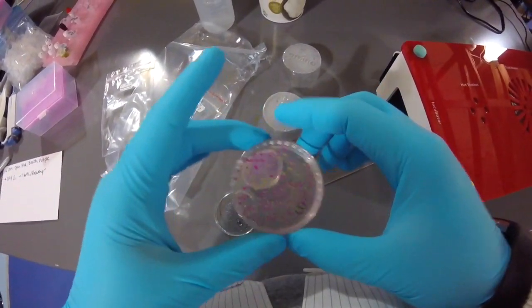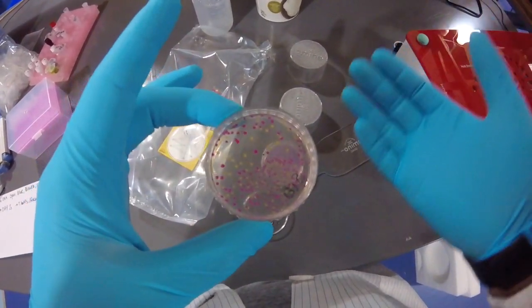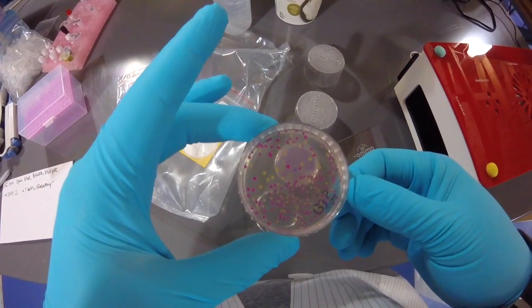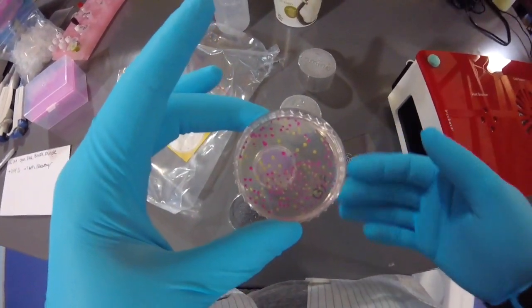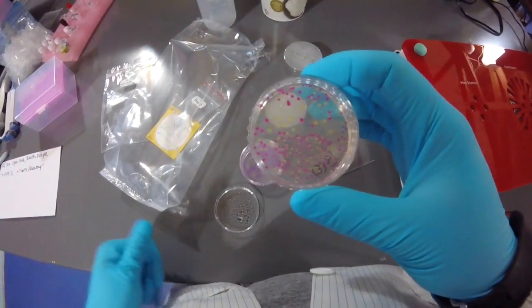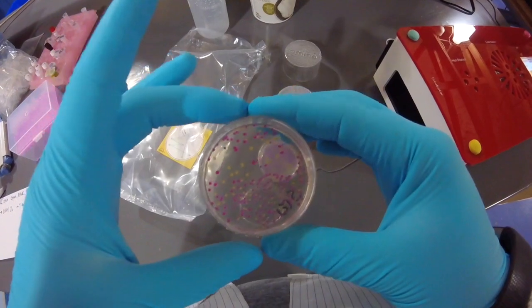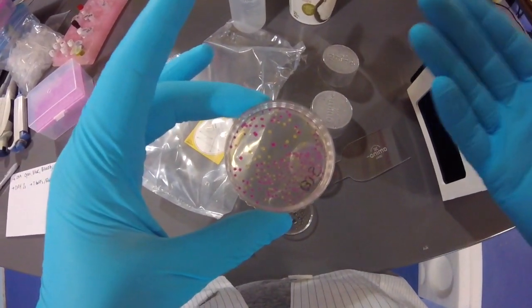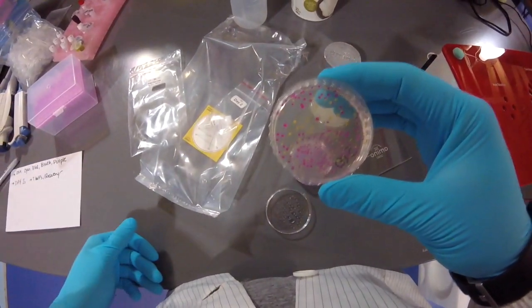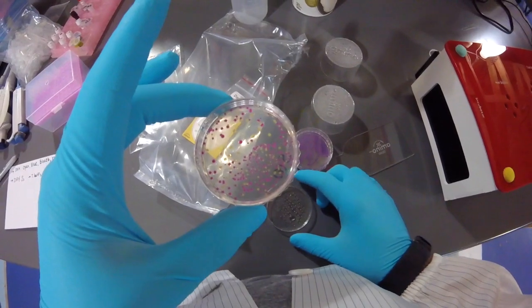And so you might ask, how do we get this result? Why are there different colors? Really the reason is because the DNA we used is a mixture of different plasmids. Those different plasmids have the same selection, so they can all withstand this antibiotic, but they have different genes for the color pigments. So they're just expressing different colorful pigments, and when you transform, a typical cell will take in around one plasmid, maybe a couple, but if a couple are in the cell it will generally grow and divide and lose one of those two plasmids. It's just a natural thing that happens, and you're basically left with bacteria with one of those plasmids, and the colony ends up representing growth from that single bacteria producing those colored pigments. So that's why we get different colors: we just had different plasmids in that tube.